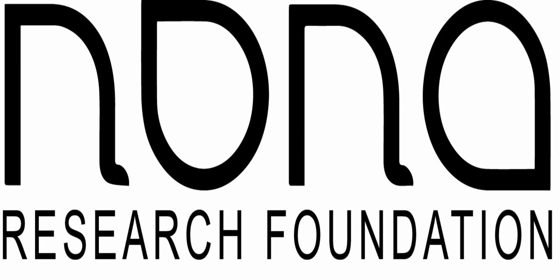it comes to formats. It's quite tricky in the wider life sciences industry to do something like this, just because there's so much fragmentation. Even if we took a snapshot of all of the types of instrument and labware and everything right now, and managed to get standard formats and schemas for all of these sorts of things, in a year's time, there will be new ones, so it's a constantly moving target, which makes it really difficult.